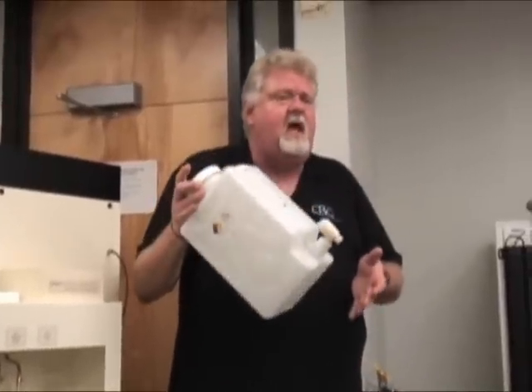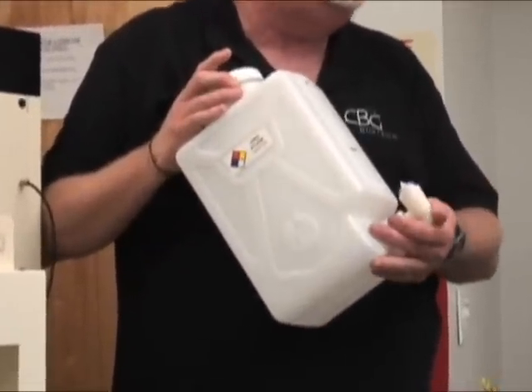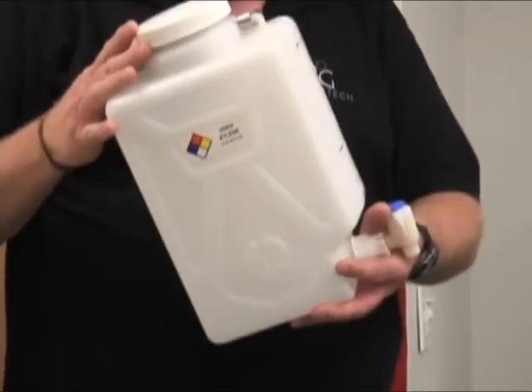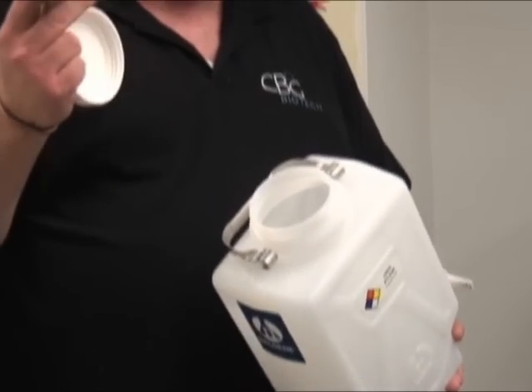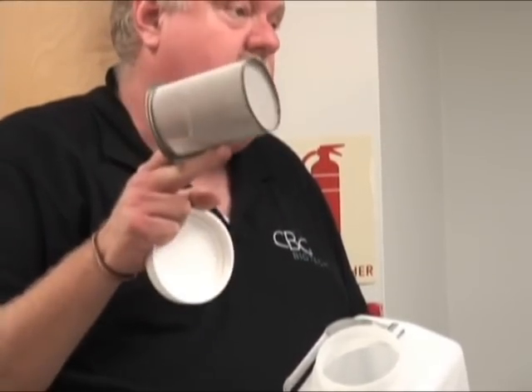This is a Nalgene two and a half gallon container with a white Teflon spigot. This is to resist the solvent breakdown — you always want these white Teflon spigots with petroleum-based products like xylene. These are made by Nalgene. One thing we have developed is a fineness strainer, a metal mesh to filter out any particulars.